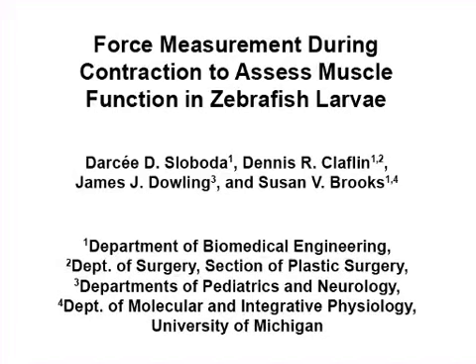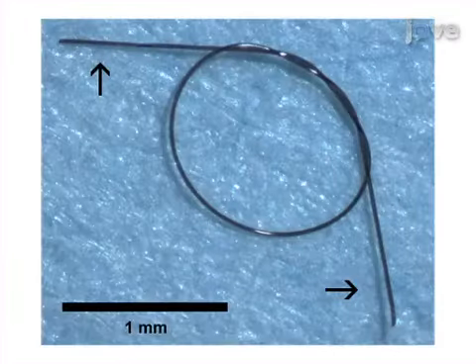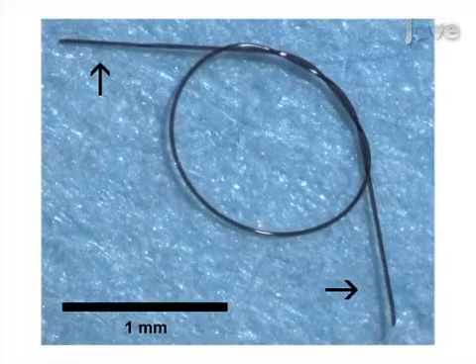The overall goal of this procedure is to measure force generation during a maximal contraction of zebrafish larval trunk muscle. This is accomplished by first making suture loops that will be used to hold the larvae in place during force measurements.